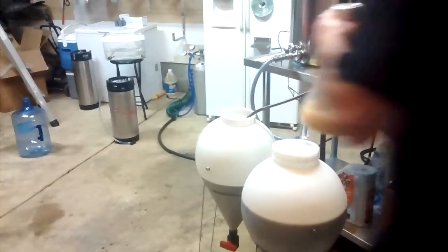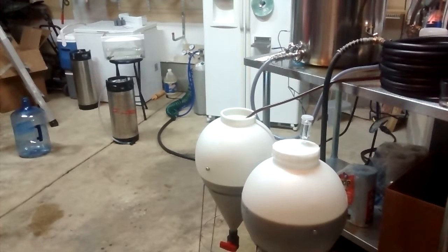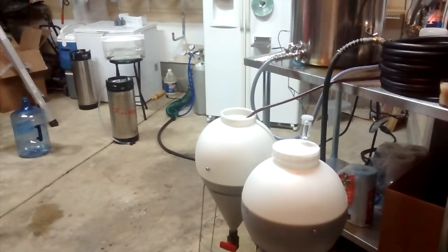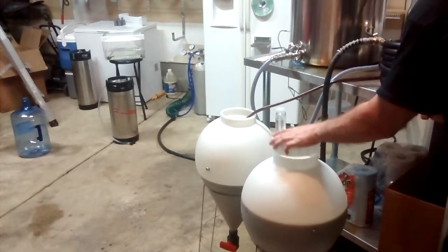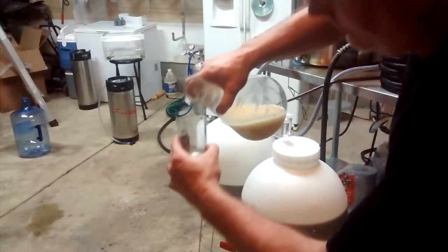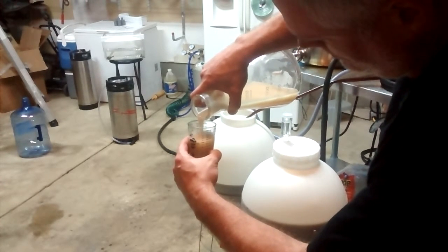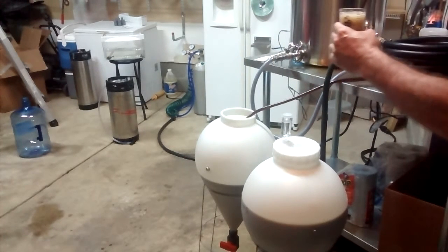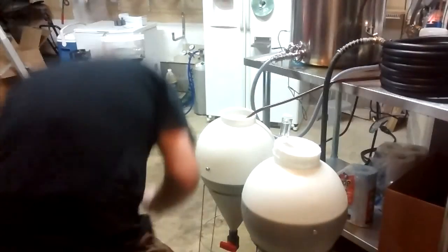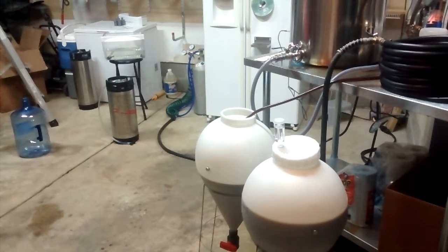Okay, here we go. It's pitching time on the first batch of yeast. For the first fermenter, I poured about 220 milliliters. There's 110. Another 110. Pitching in, I'm showing on the thermometer here, just a hair under 70. Take the yeast jug back in, put it back on the stir plate till we're ready to do the next one.